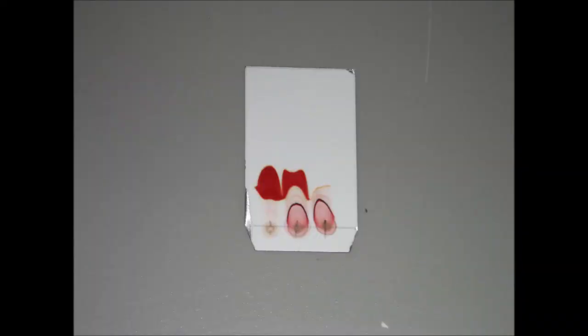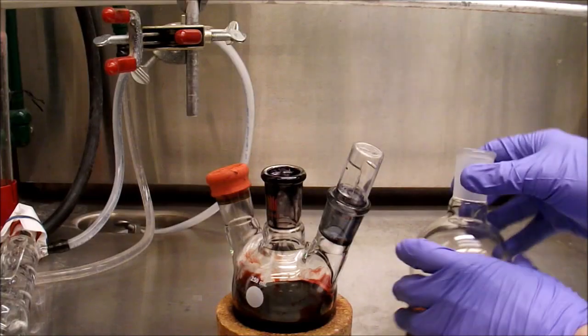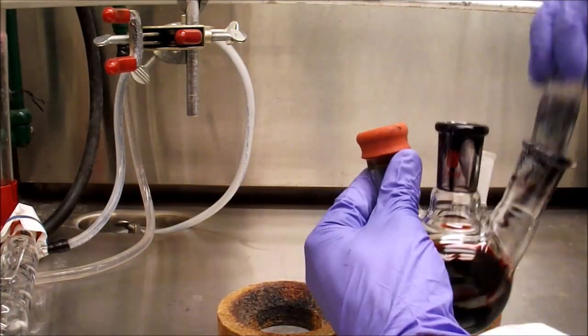After a day at reflux, a TLC is run in dichloromethane. As is my standard method, the left spot is the starting material, the middle is co-spot and the right is the reaction mixture. The TLC shows complete consumption of the starting material.